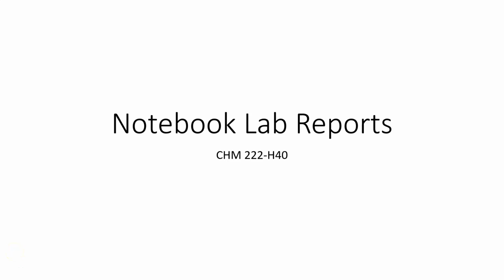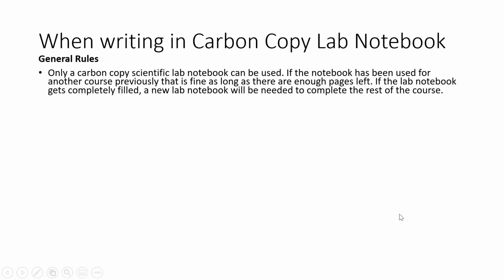This video is going to go over the expectations for a notebook lab report in quantitative analysis. Before we jump into that, I wanted to remind you of the rules and guidelines when you're using a carbon copy lab notebook in general. If you have a carbon copy lab notebook that you use in a different lab course, you can use it for this class as long as there are enough blank pages.